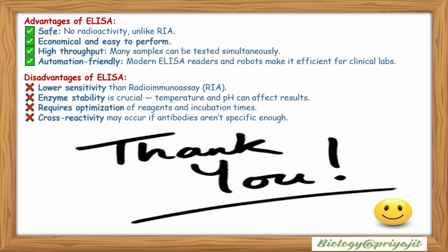So my dear students, today we have learned how ELISA provides a powerful, safe and versatile method for detecting hormones, antibodies and many disease markers, all through the clever use of enzyme-linked antibodies and color-based quantification. Whether in medical diagnostics, research labs or public health screening, ELISA remains one of the most trusted immunological tools.